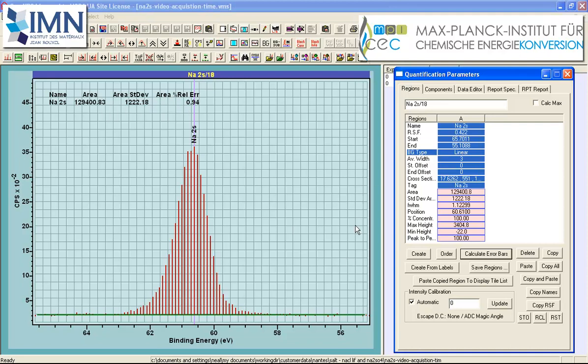One way of viewing the use of this average width is that the time invested in the intensity that has been used to calculate the background has now increased by a factor of 7. So had we measured the same data for a dwell time 7 times longer than the one that was actually used, we ought to have arrived at the same error that we see here.